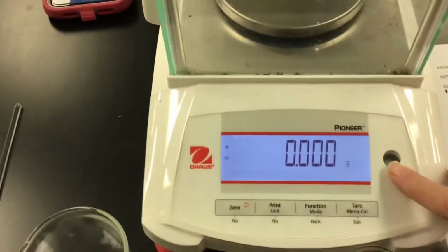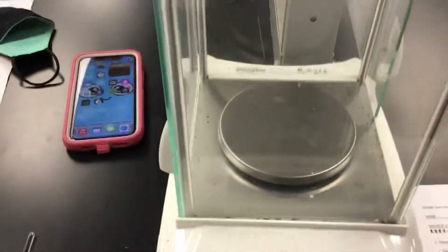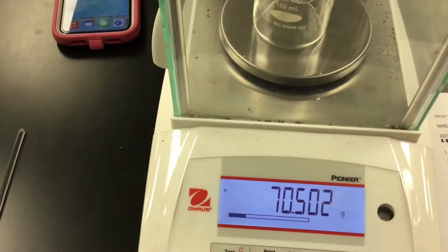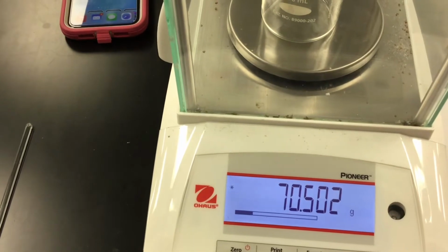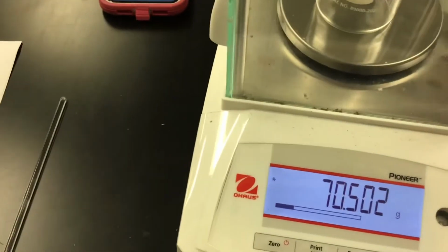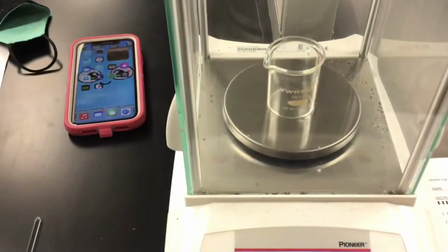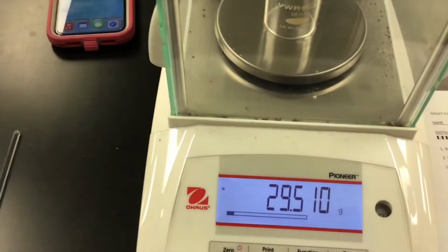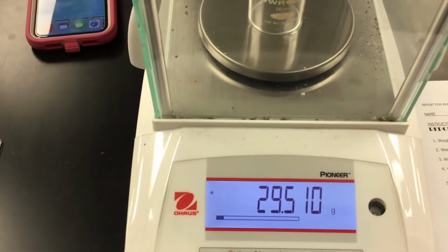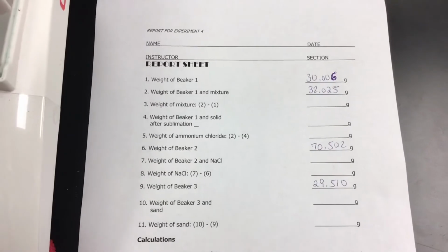Alright, so we're back at the balance. I'm going to push tare, even though it says 0. I'm going to open it up, and stick that beaker 2 right in there. And then I'm going to write 70.502 for the weight of my beaker 2. Then I'm going to put my beaker 3, my 50 ml beaker, on there, and that one is going to go with position 9 on your lab sheet, and I'm going to have 29.510. Okay, so that's what my lab sheet looks like at the present time.